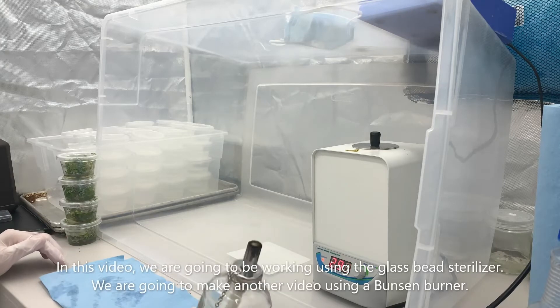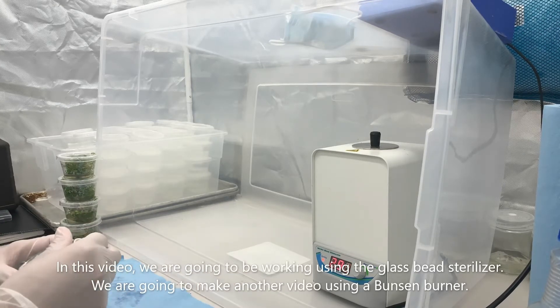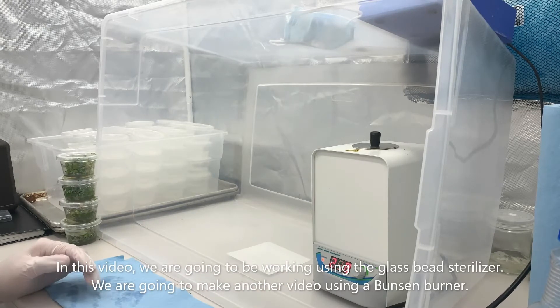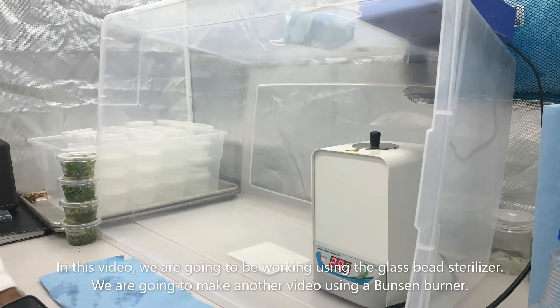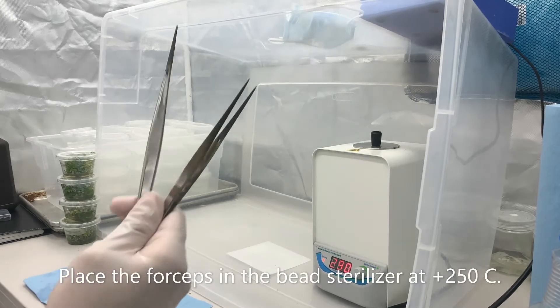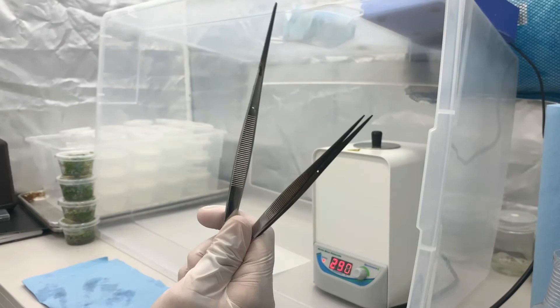After cleaning your work area, we're going to be using a glass bead sterilizer. Normally we would be using a Bunsen burner, but for the sake of this video, I'm going to teach you how to use this. Place your forceps in the bead sterilizer at above 250 degrees Celsius.